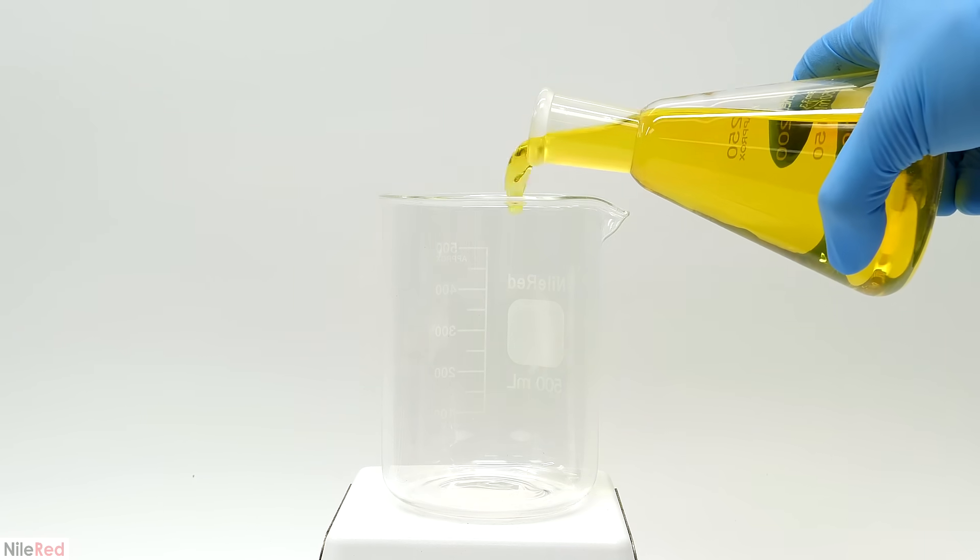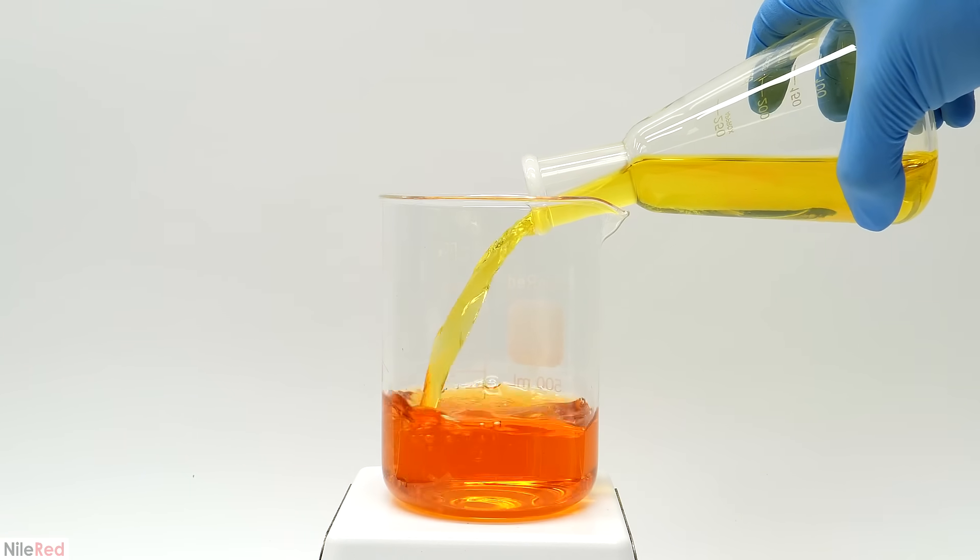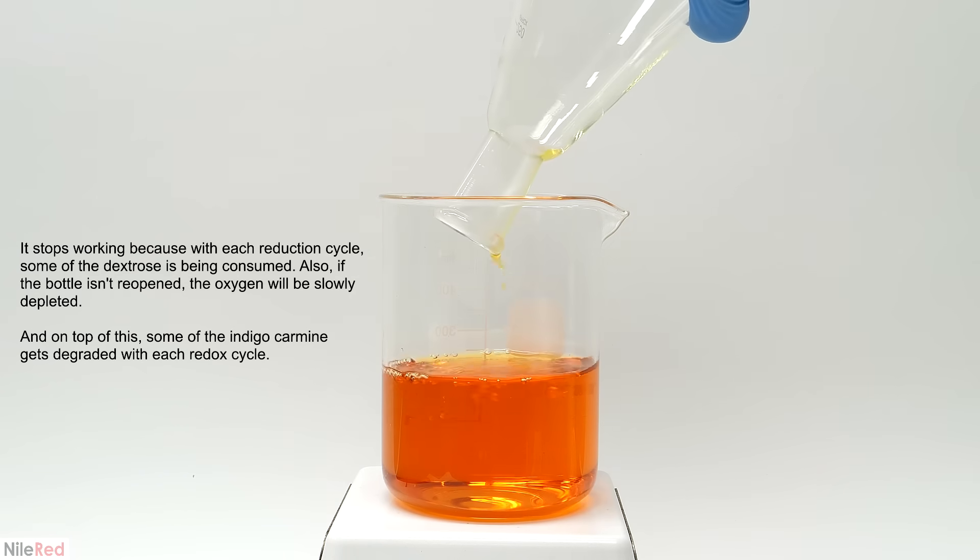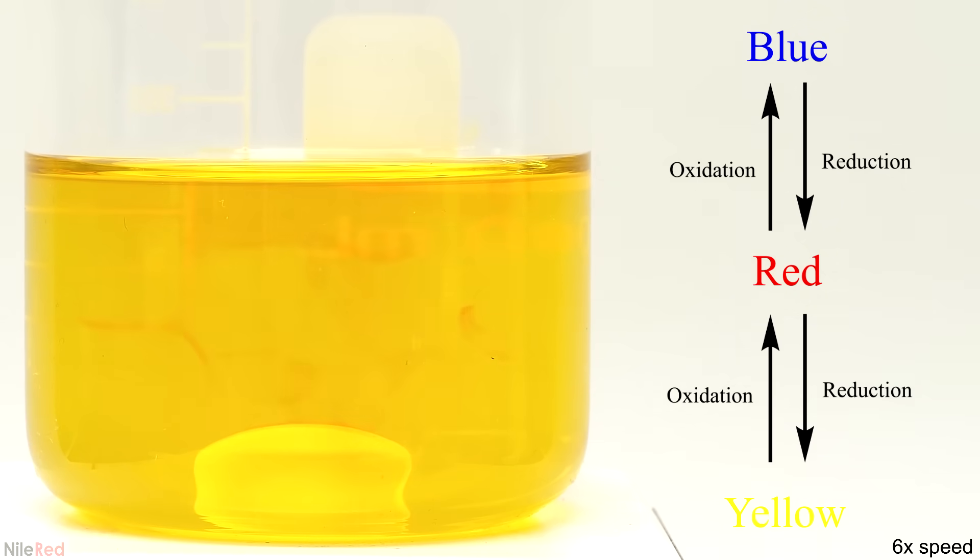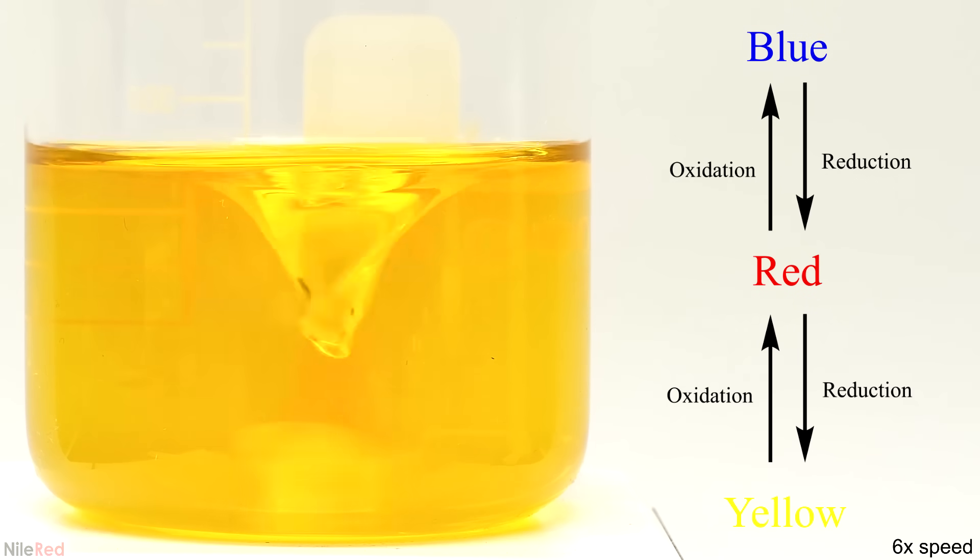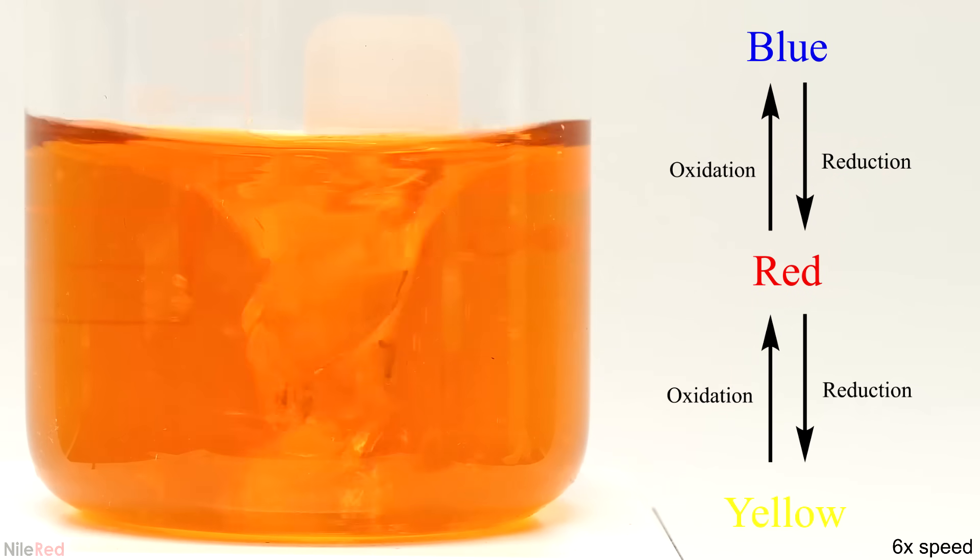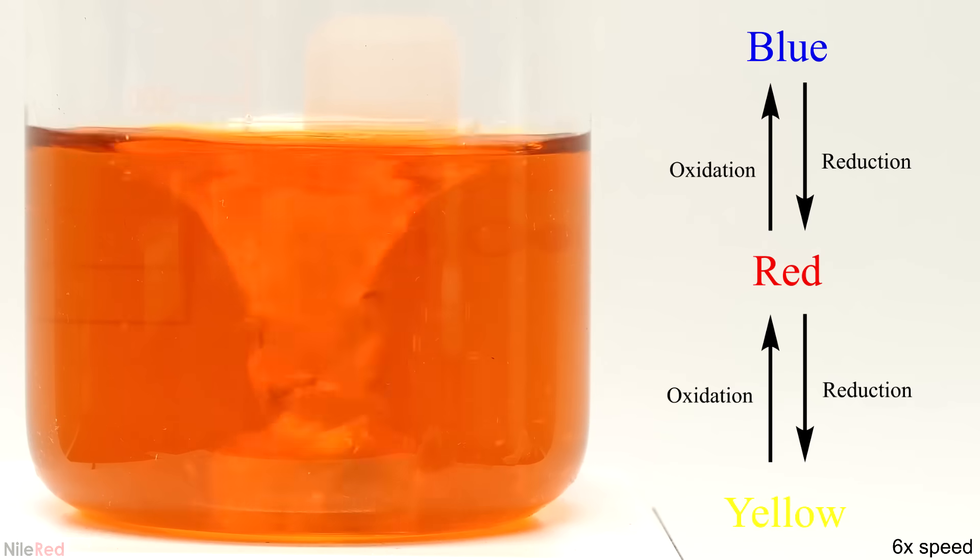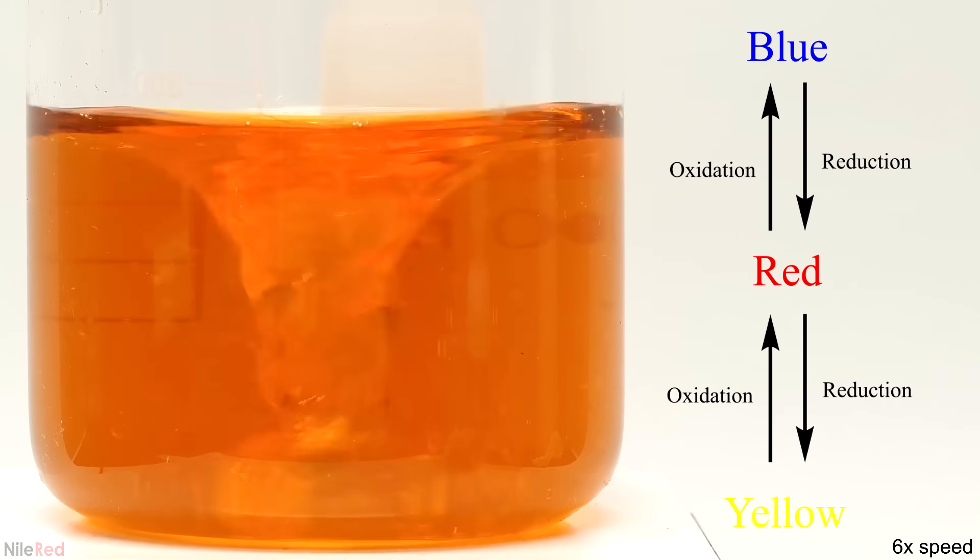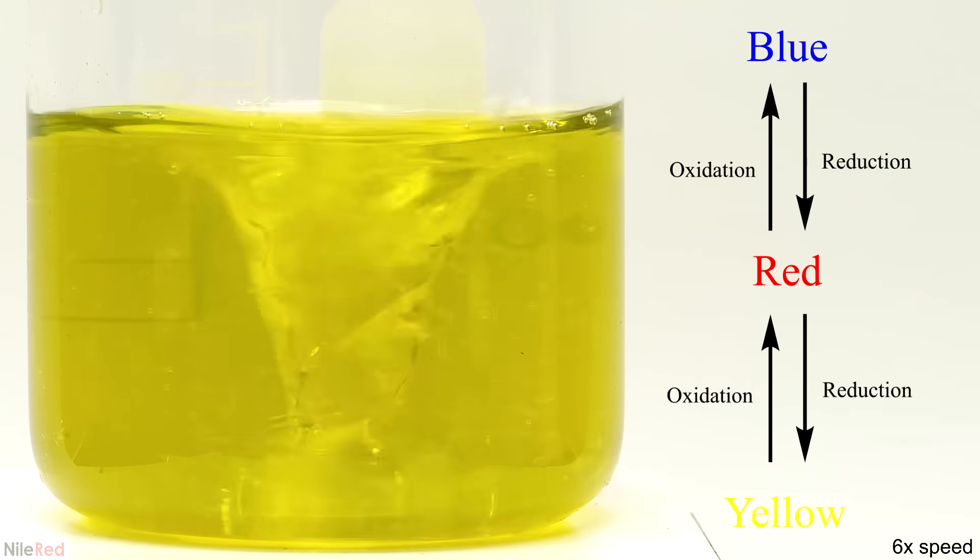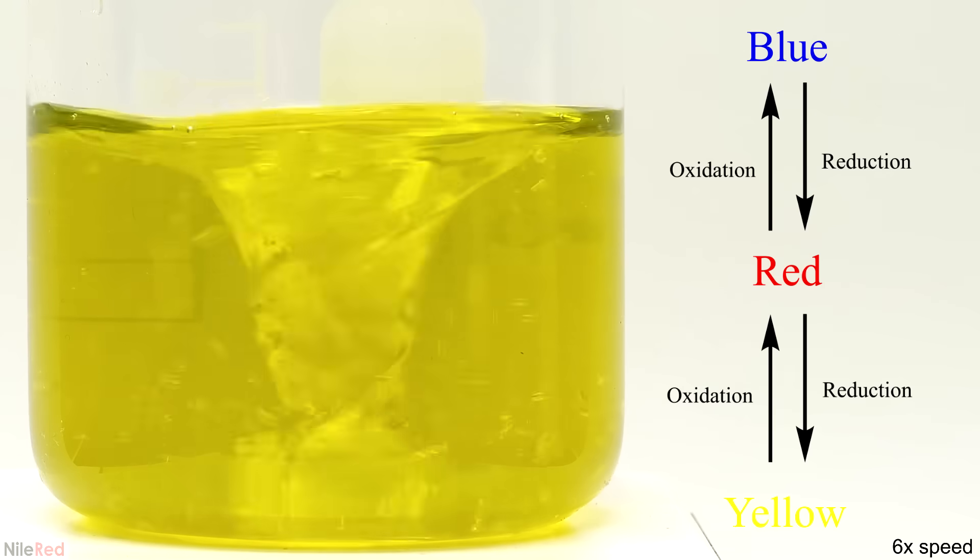And once it's fully reduced again, it can be shaken and the cycle can be repeated. I never tried counting it but I think you can do it at least four or five times with pretty decent results. So with all that being said the basic idea behind this process is that it's a battle between oxidation and reduction. On the reduction side we have the sodium hydroxide and the glucose which are always trying to give electrons to the indigo carmine. Then on the oxidation side we have oxygen which is always trying to take them away. And the final effect that we get from this is an oscillation of the indigo carmine between its fully oxidized form and its fully reduced one.